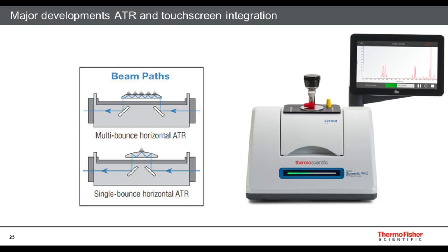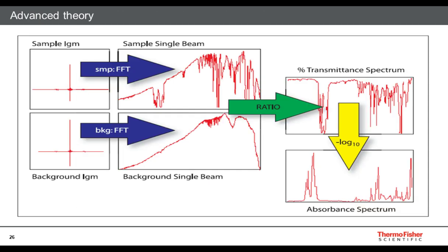But when it is in contact with that point, then the evanescent wave will couple light into the material, and you'll allow absorption to occur without any direct interaction between the light itself and the sample, which is pretty interesting stuff. But it really simplifies getting your students through a given lab quickly and moving things along.